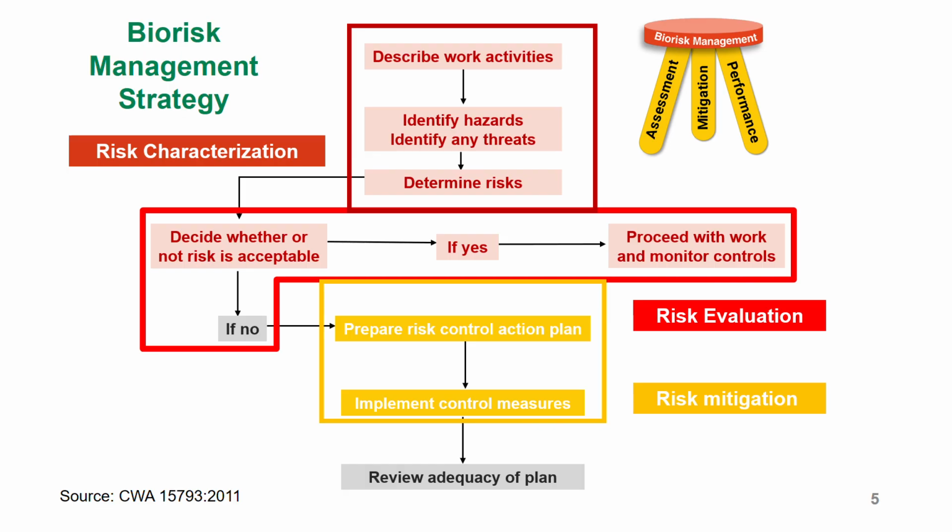But then the problem was not really about the equipment itself. Maybe the problem was just the implementation strategy that you used. People did not understand how to actually utilize that control measure, and therefore it did not work. So you need to check all these things.